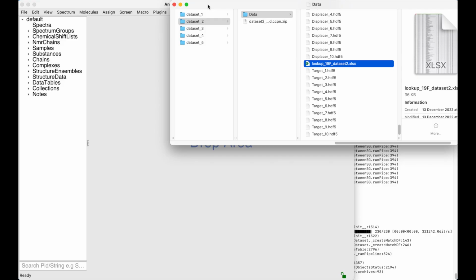In this demo, I will show you how you can analyse screening data which is based on Reference Singleton Spectra, i.e. where for each compound in your library you have a separate reference spectrum. Obviously for your control, target and possibly also displacer spectra, you will be using mixtures or cocktails of compounds.